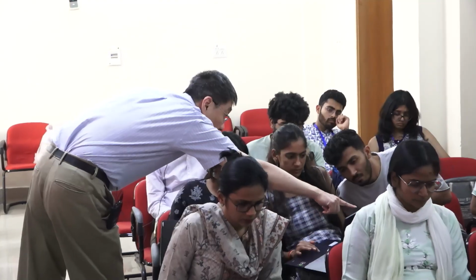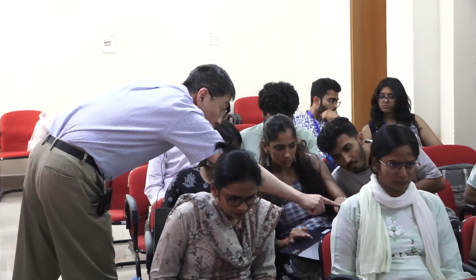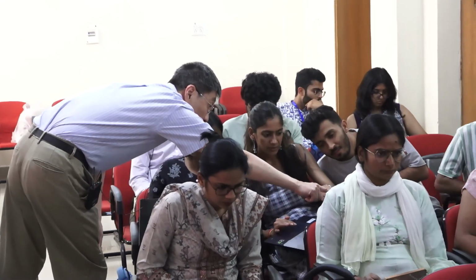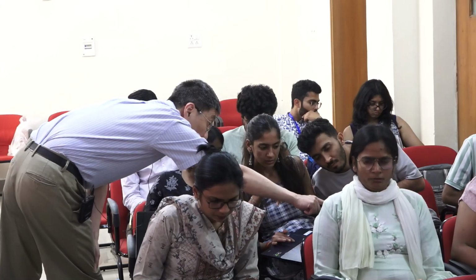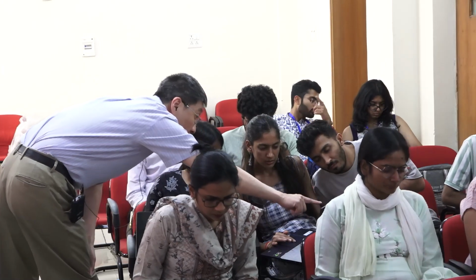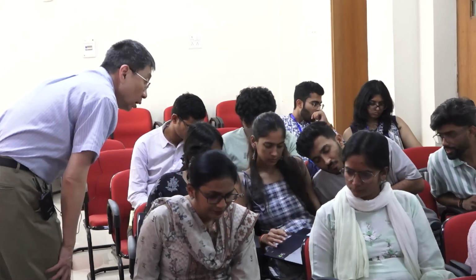Scroll down. There's a scroll bar down below. So 169. Do you see 169? There is no 169. 166 is, yeah. That's 166, right? So that 166 is under the 1. So it count to 169. That should be a phenylalanine. Click on the phenylalanine. Do you see it?